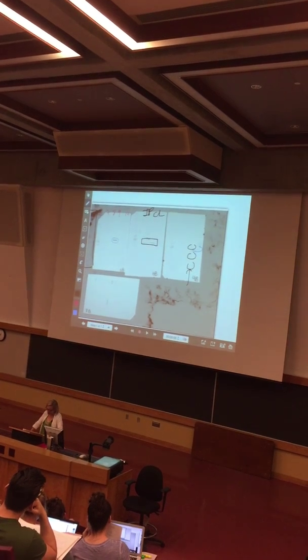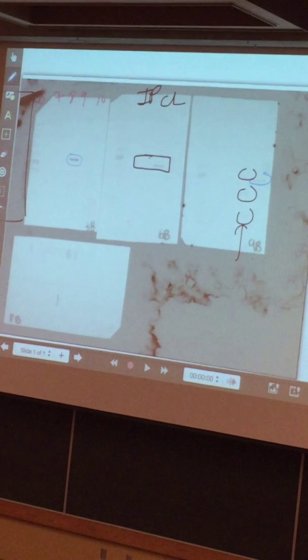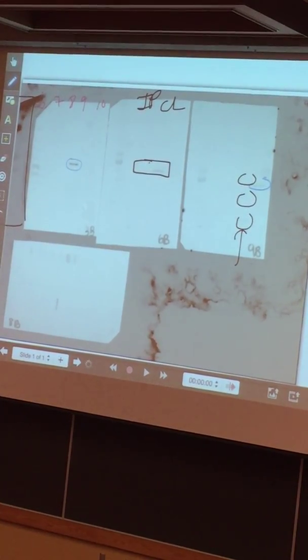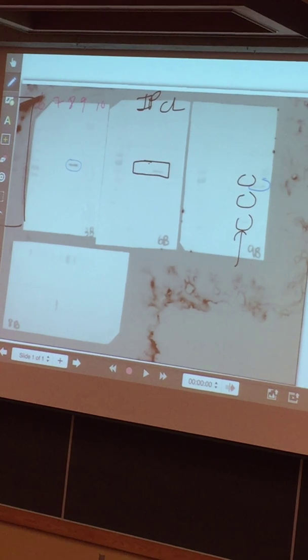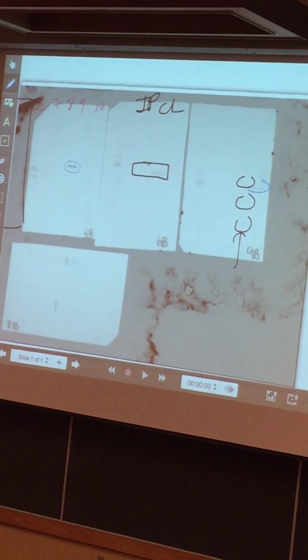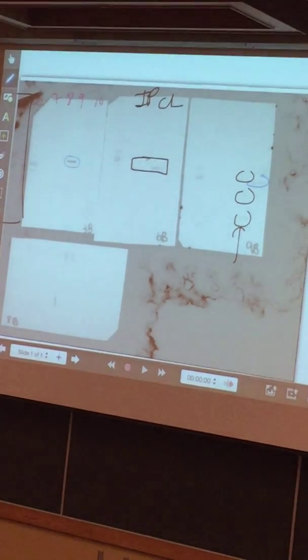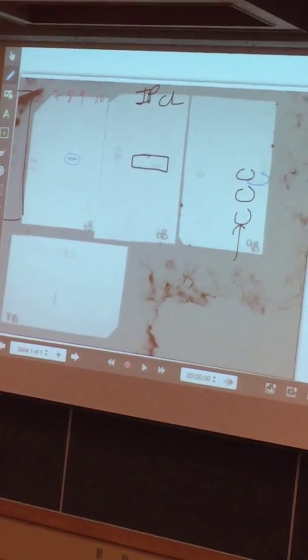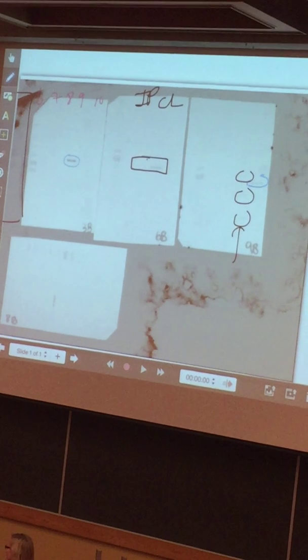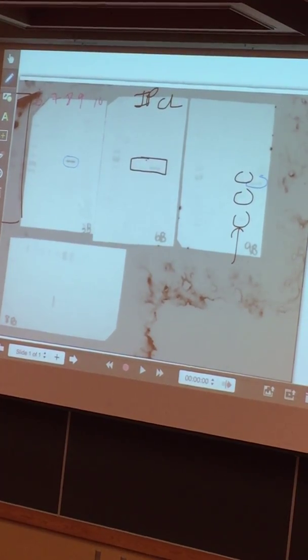So difficult to say. Maybe non-specific binding, maybe something else is the cause of it, but whatever it is, it's reacting with your primary or your secondary. The signal that you see on the membrane will be reacting either with your primary, and then the primary of course is recognized by the secondary, then you get a signal, or you can also have a situation where your secondary is reacting with your targets, right, with antigens, and then you will see them too.